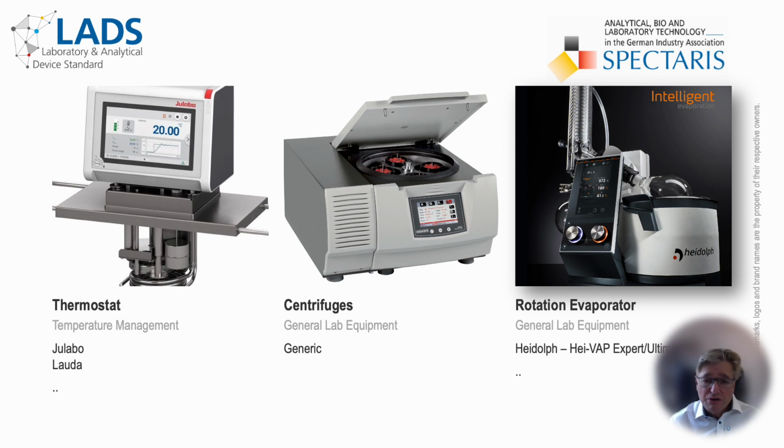Temperature control of processes is a standard task in laboratories. A typical type of equipment for this task are thermostats, as depicted in the left image. A LADS OPC UA prototype integration for a Julabo immersion thermostat was presented at shows such as this year's Future Labs Live.